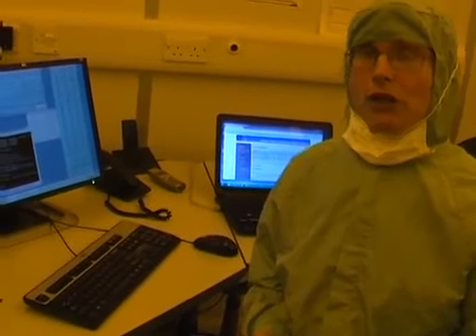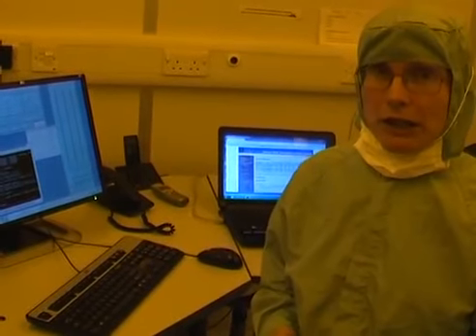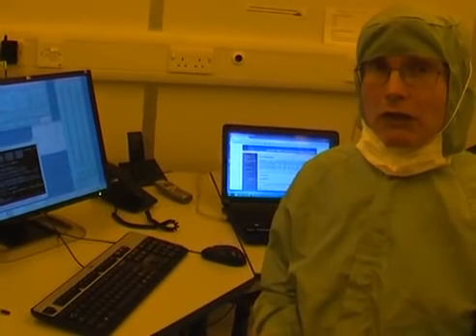Another thing to think about is clamping. A lot of people don't like too much of their samples clamped, but if your sample isn't clamped properly, securely, it doesn't lie flat, and then we can't run it at all. So please make sure that there are 2 or 3 millimeters free for the clamp to sit. Otherwise, it becomes very difficult to load.